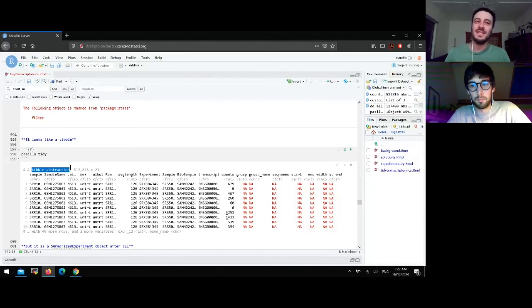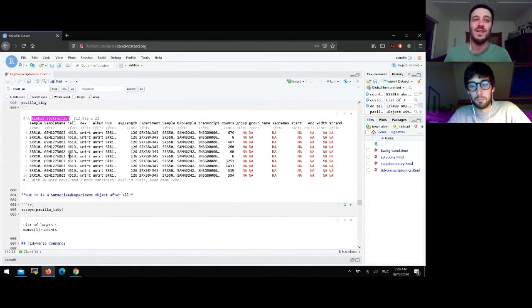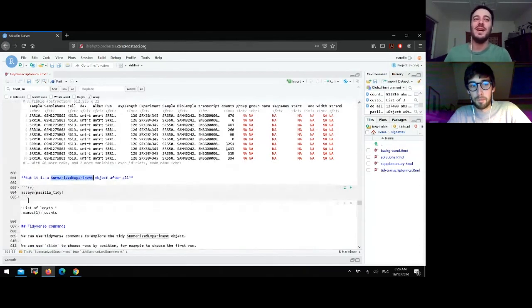The difference is that the data is not actually stored in a data frame, but the source of the data is still our SummarizedExperiment object. So we can query this object as we do with SummarizedExperiment, because it is a SummarizedExperiment, and we can apply all algorithms as we are used to on this object.